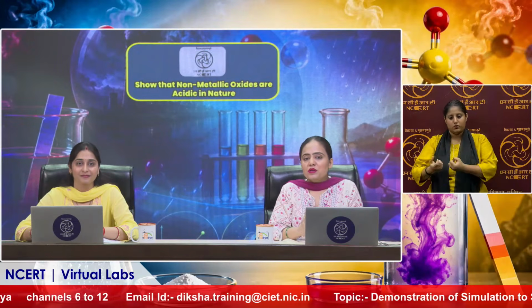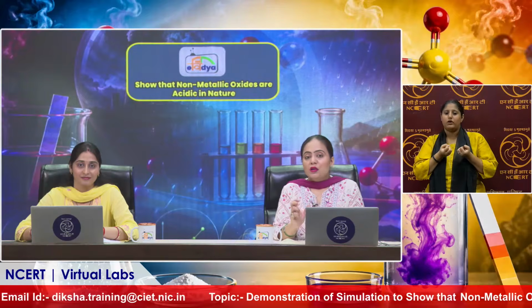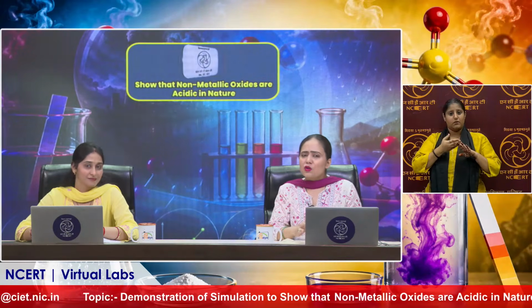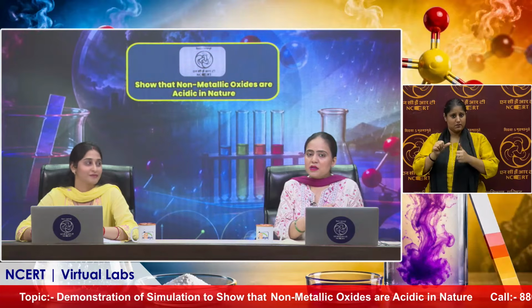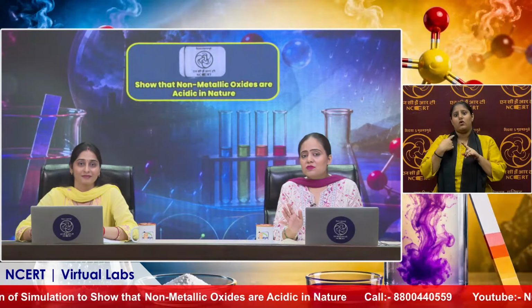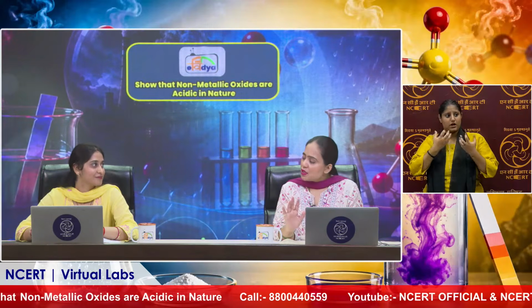Now, ma'am, suppose this is for grade 7, but I still want to brush up what I have learnt in the previous class. Can I go back to the previous class experiment and perform the same? Also, I'm through with all the concepts of class 7. Now I want to read further, learn further. Can I perform the experiments of higher classes? Yes, of course, you can perform those of higher classes as well as of lower classes.